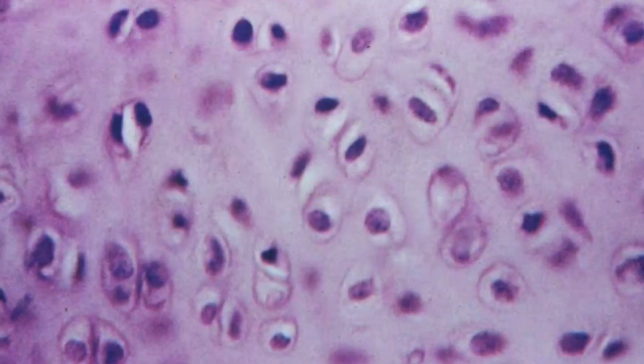Cartilage. There are three types of cartilage found in the human body: hyaline cartilage, elastic cartilage, and fibrocartilage. When you talk about cartilage, look for a specialized cell. It is called a chondrocyte in the lacuna. Lacuna, by the way, is space.